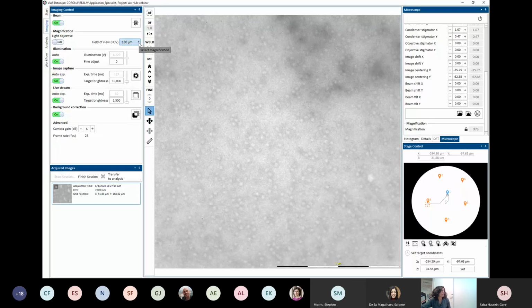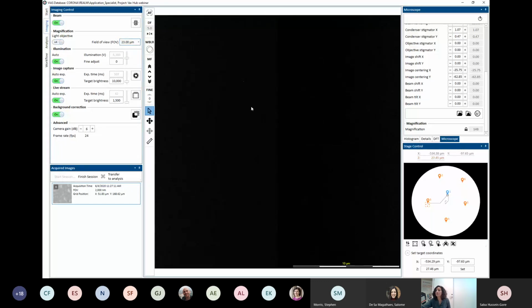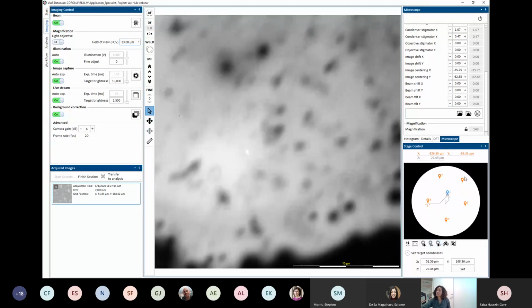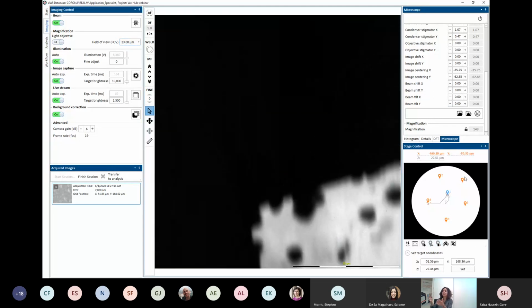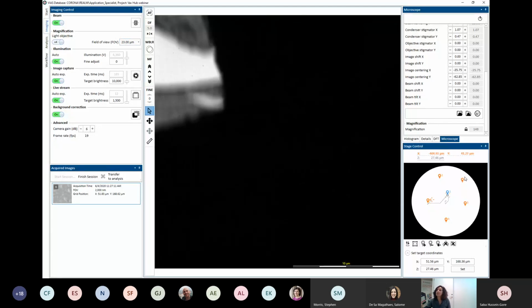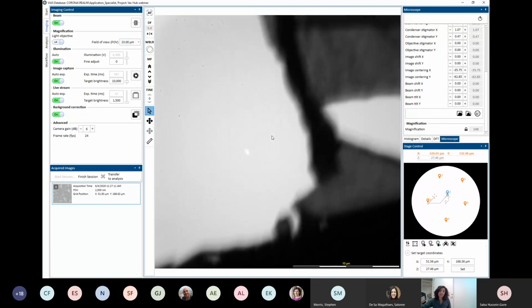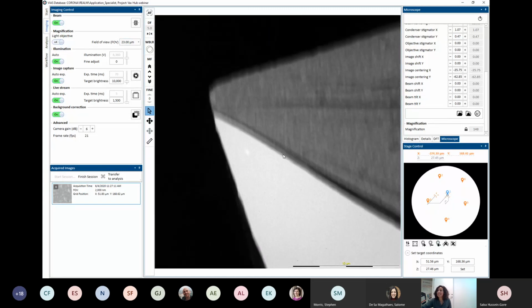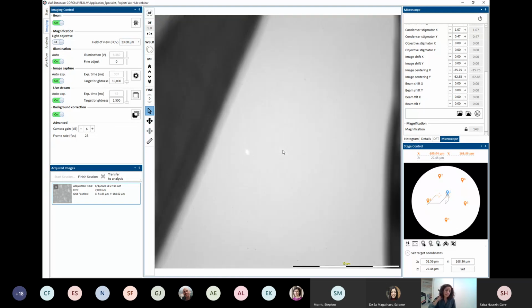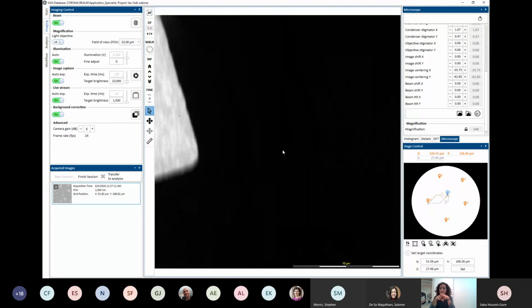And to make the journey a bit faster, I'm going to zoom out, and I will click move stage to the selected waypoint. And now I'm zoomed out, so we can get a sense of it. There's a broken grid. It really isn't the best grid, but it's okay. But I guess it also shows the importance of checking more than one area of the grid.